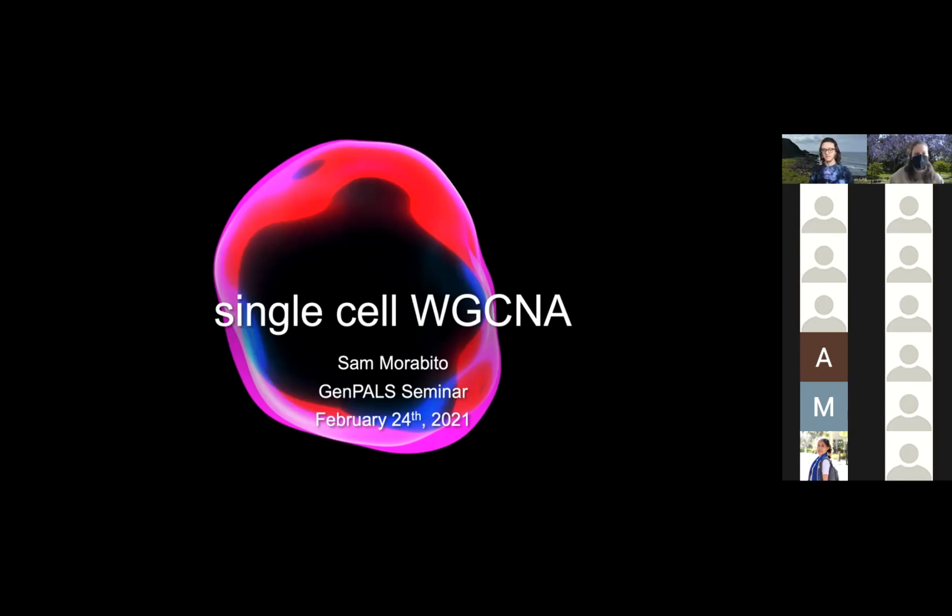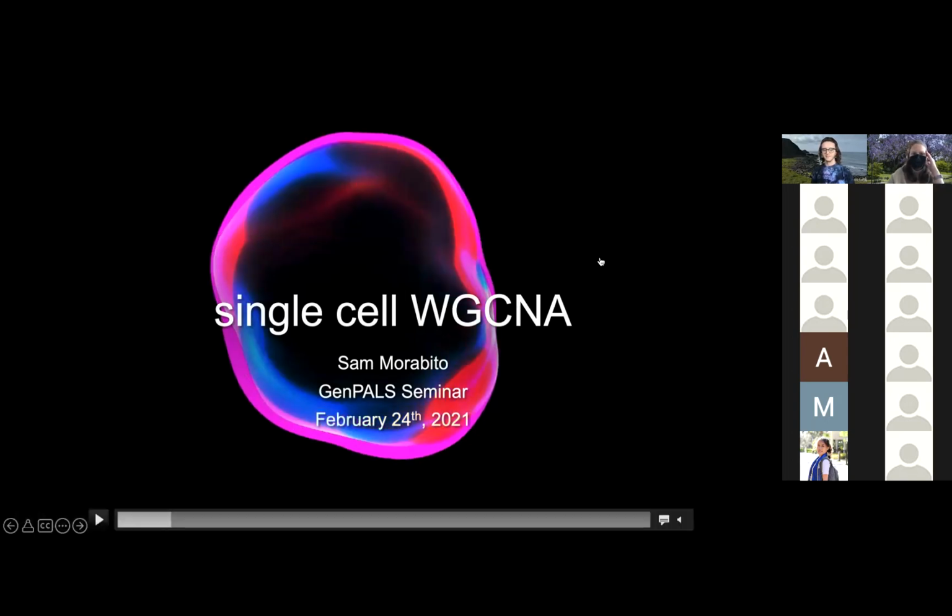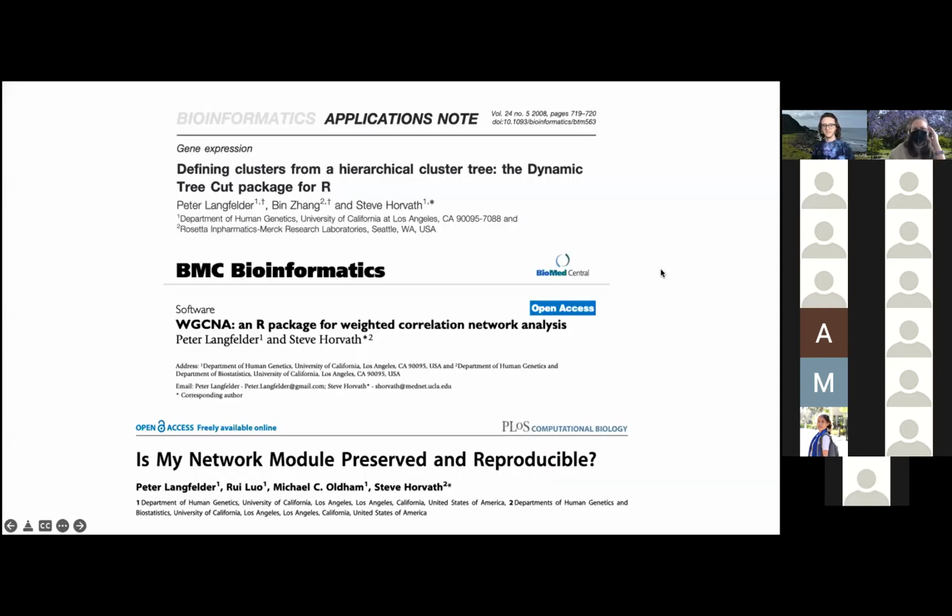Okay, thanks, Fairly. So I'm going to talk about single cell WGCNA. First of all, I hope you all know what single cell is, but what the heck is WGCNA? It's actually, at this point, an ancient way of analyzing gene expression data. And specifically, it's looking at co-expression networks.